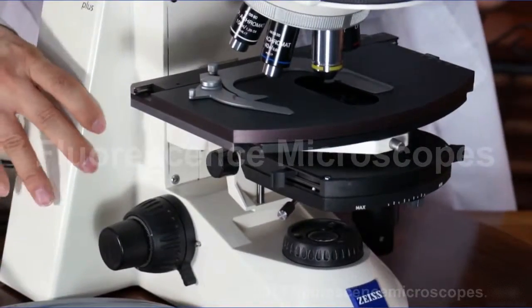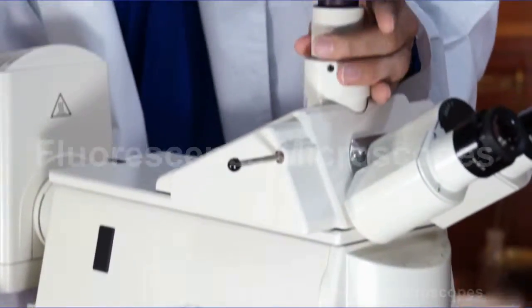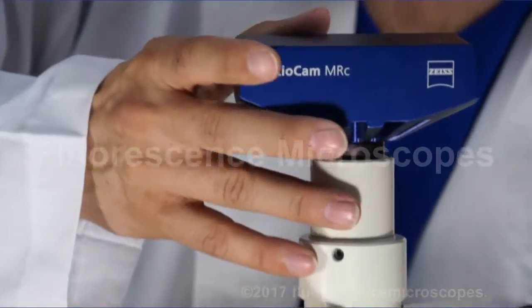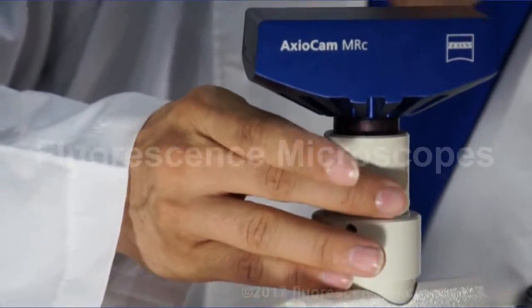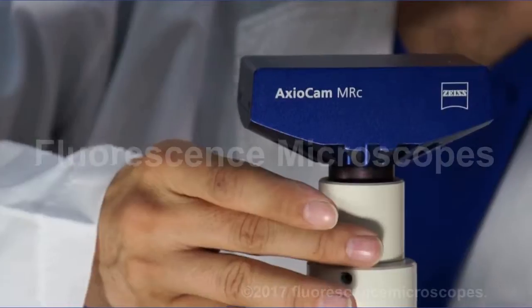We've configured it with a camera and a C-mount, but you'll have to look at the ad to see what camera's included, if any. We can add different versions of cameras.